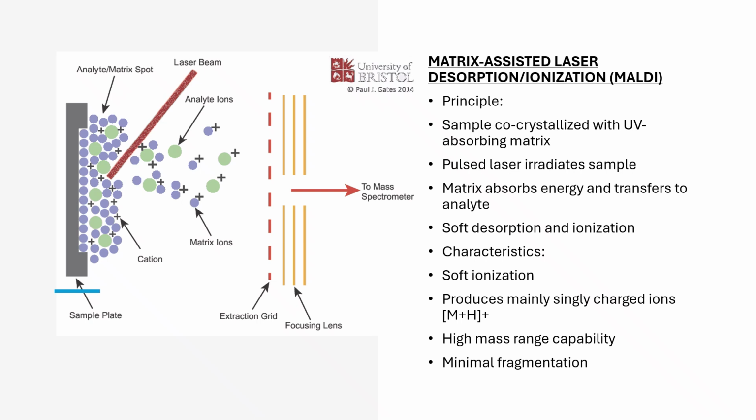Then you hit this with a pulsed laser. The matrix absorbs all that laser energy and transfers it to your analyte, causing soft desorption and ionization.